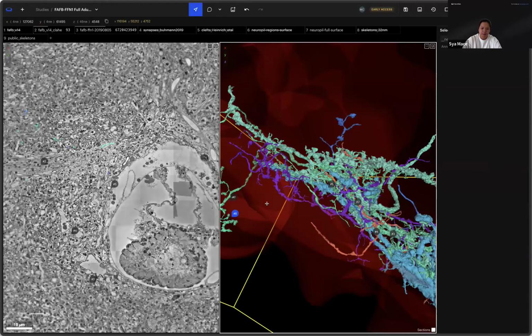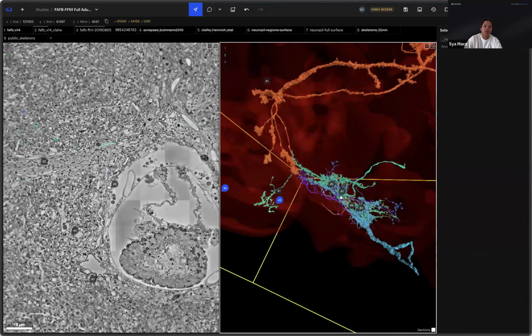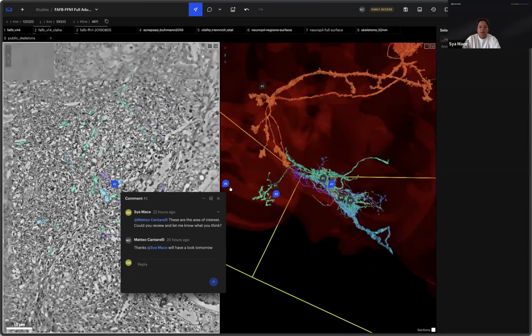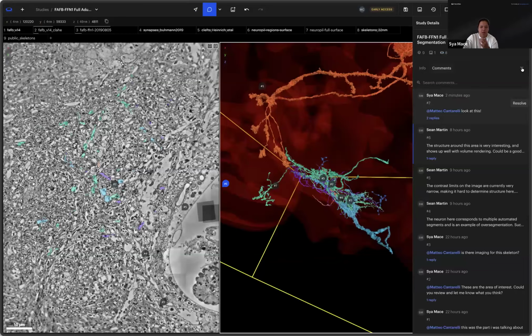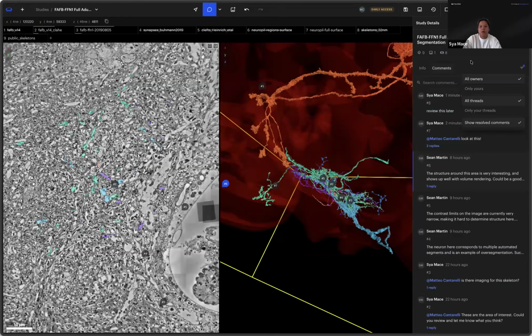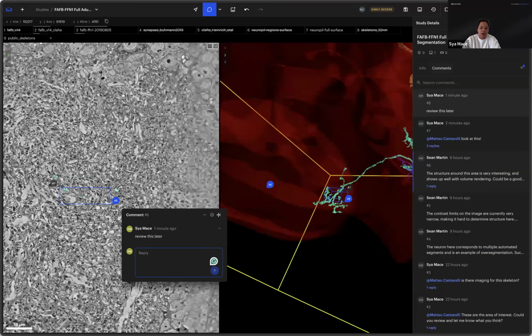Right. So here you can see all the comments are attached to a number, just to make it easier to differentiate. You have hashtag 2 on here. This is the equivalent comment on the 2D panel, essentially. And if we go back to the sidebar, say you're done reviewing, I just mark that resolved. That is a functionality that commenting usually has. You can just resolve, and you can filter that back in to look at it. Maybe you want to open that thread again, you can unresolve it. And then you can focus back on that area and you can start commenting again.